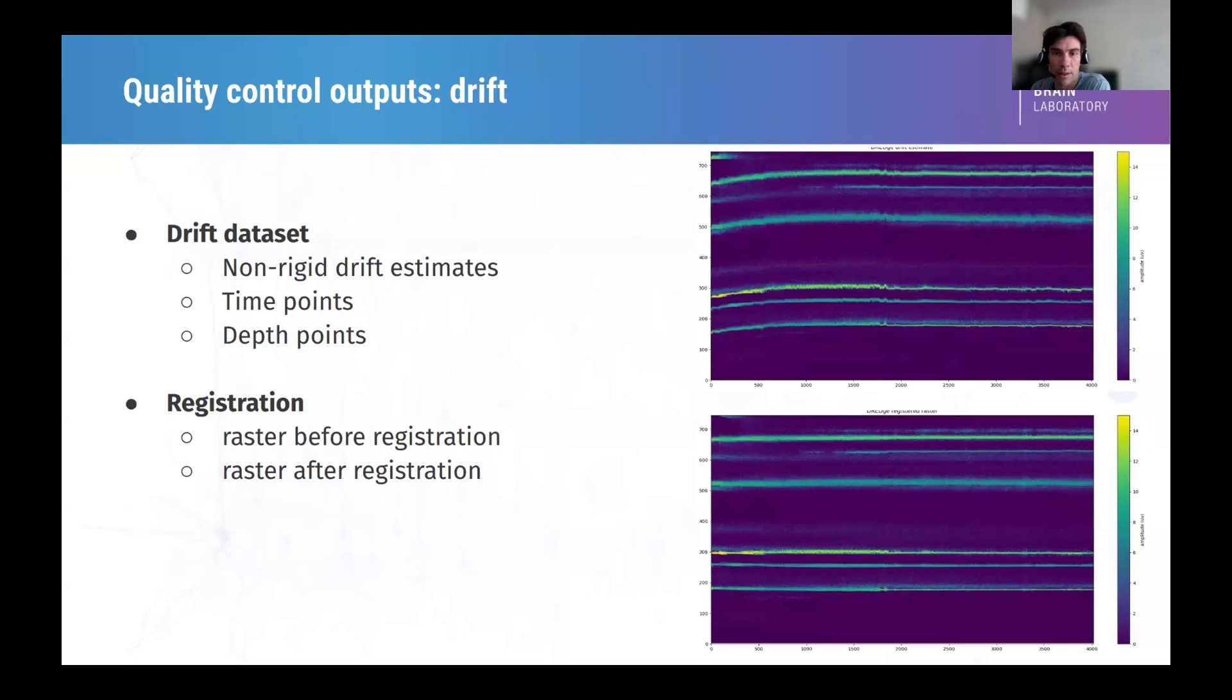Another output is quite common. It's quite nice to have the drift output and some picture of the drift. So we have a raster of the drift. So this is for a full session here. We have the raster plot, which is the amplitude and the occurrence of the neurons here. And we can see we have motion on this probe. At the beginning, the probe seems to be moving or the brain relative to the probe is moving. And we have an example of after registration on the bottom. This is a good way to see there is a big issue with the drift registration. Since this was a black box before, it is hard to know that you have a problem with drift registration. Now it's possible by looking at those pictures.